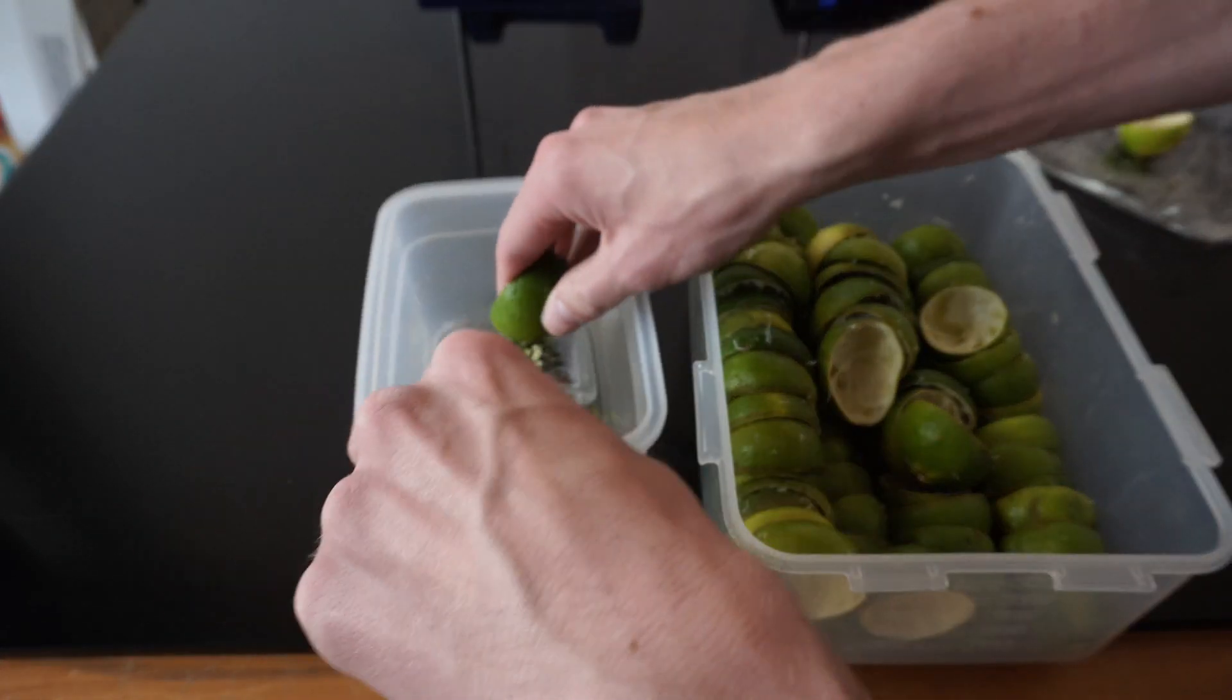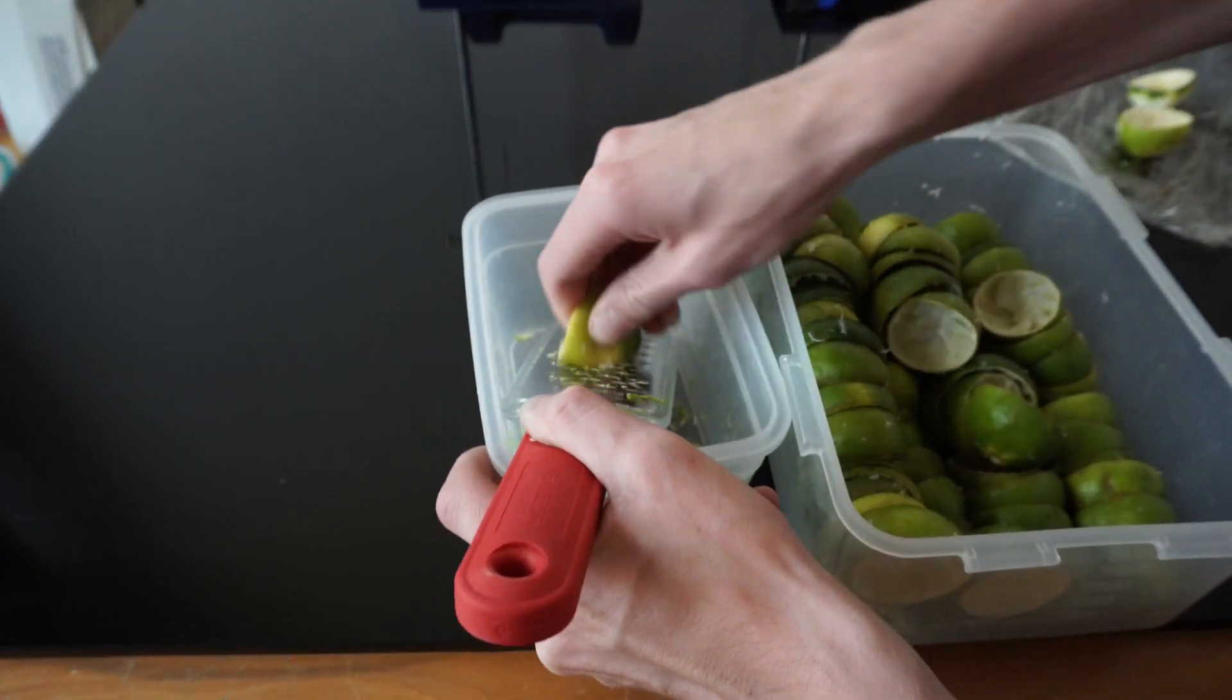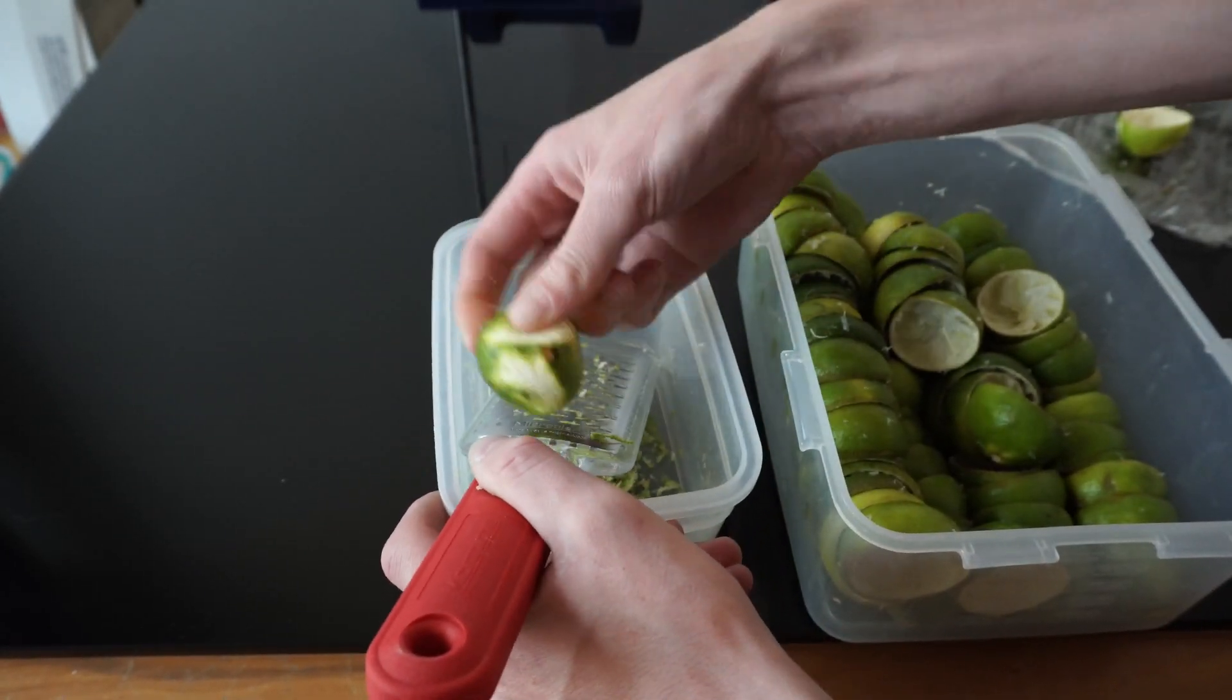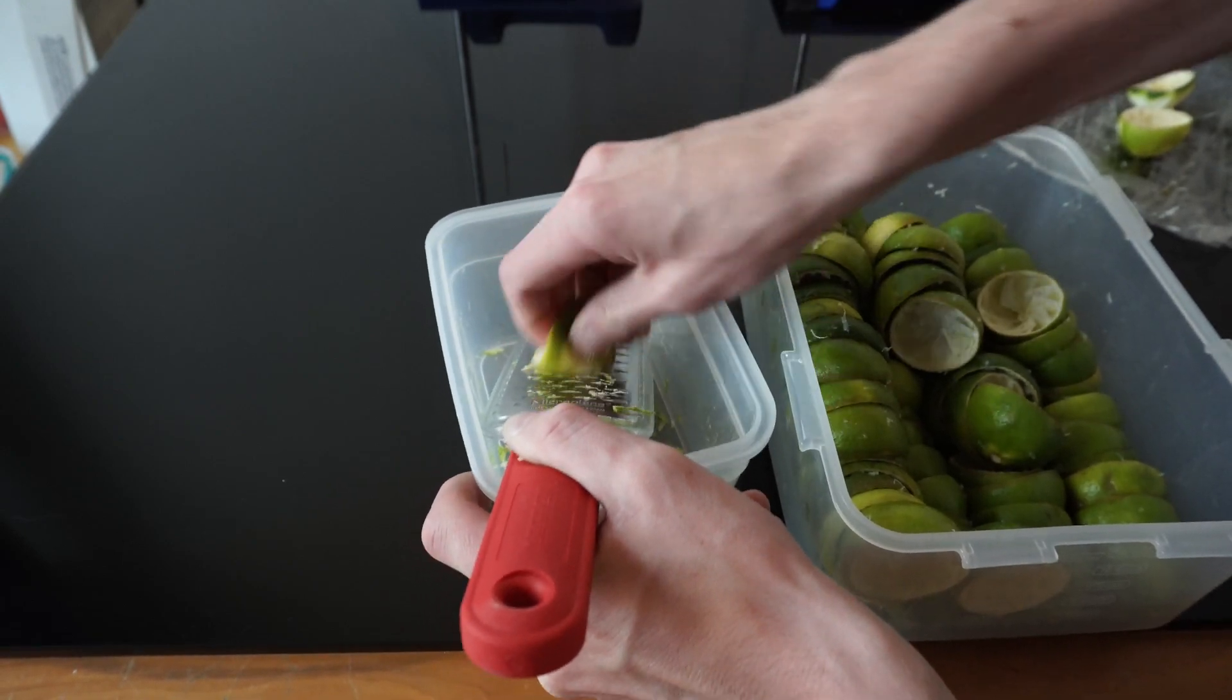I zested about 30 limes, which gave me in total about 200 grams of lime zest. The process of pulling limonene from citrus is very easy and straightforward.